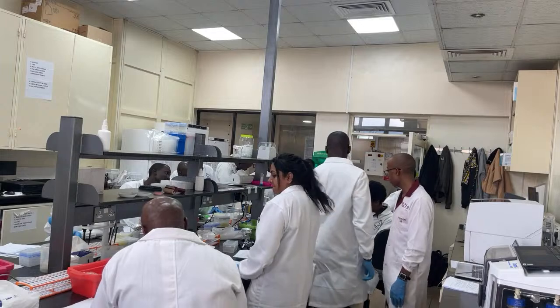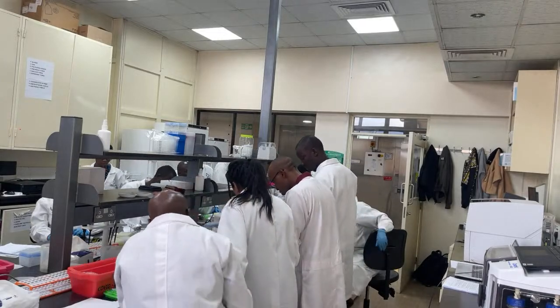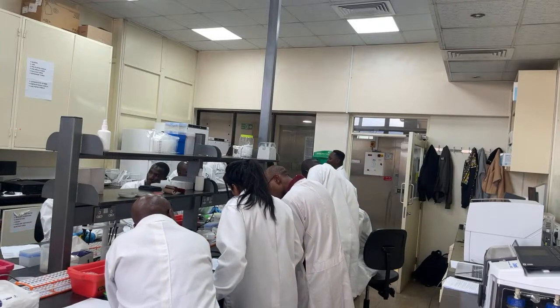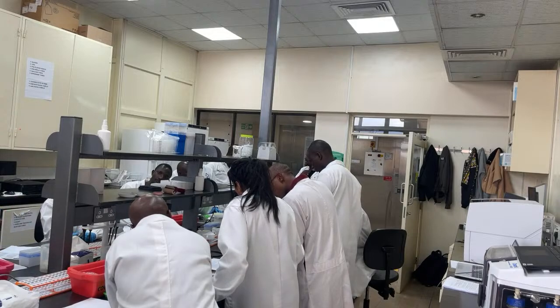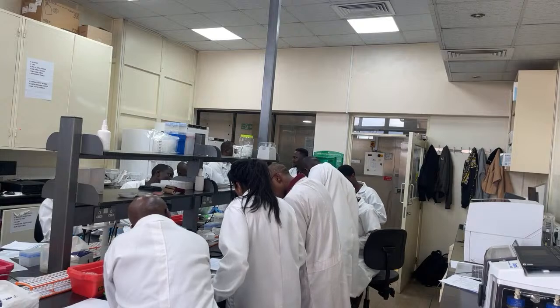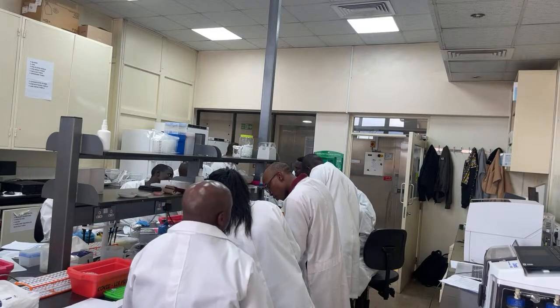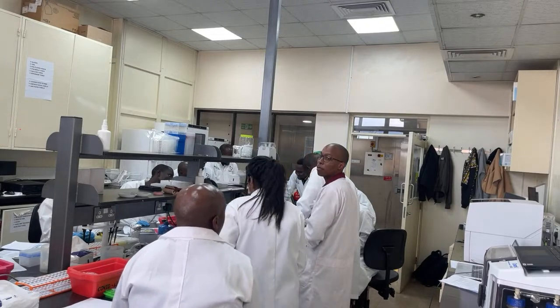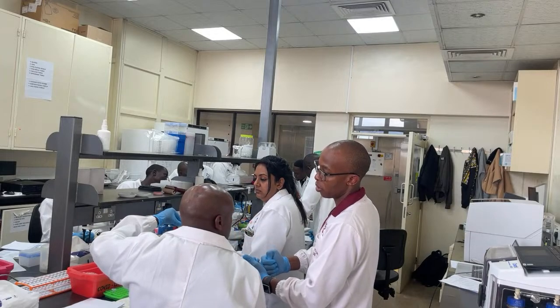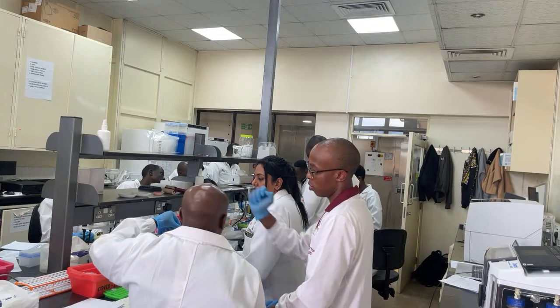How far are you guys supposed to go? But this one we don't put back to the magnet, right? So this time you just go straight into the liquid, extract, and then get access to the liquid. Same thing.